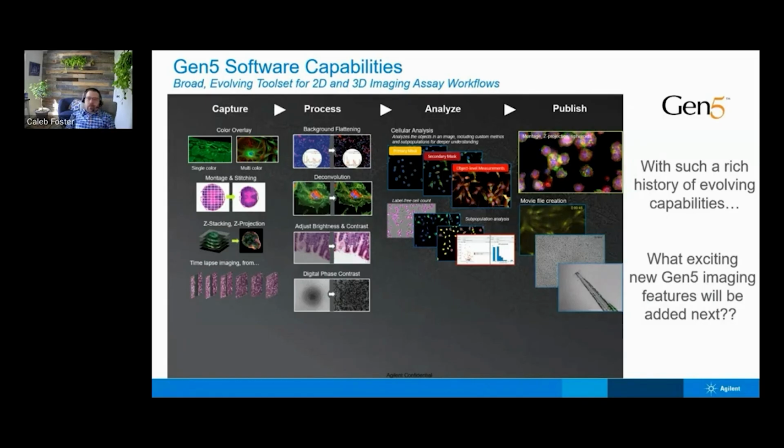Our imaging systems, from a fluorescence standpoint, we do a lot of things in our imaging systems to drive strong consistency and signal, and our cameras are very stable. And so one of the things that we manufacture, we hold every LED or laser that's used in our system. We track the intensity well to ensure that the same light energy is used across all wells. So comparatively between wells, you can do an apples to apples comparison. And then we hold integration times and the camera gain, the camera exposure, etc., always consistent across well to well.